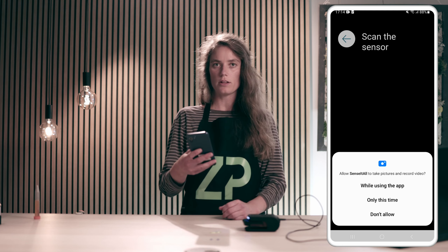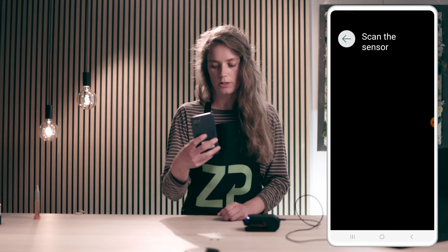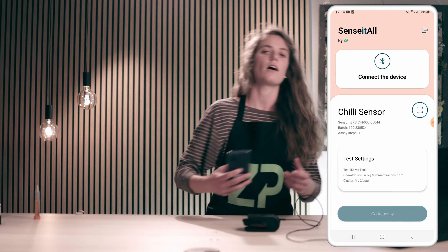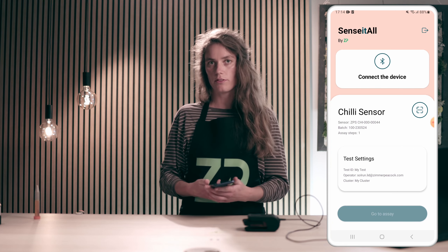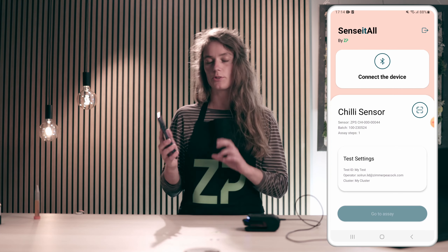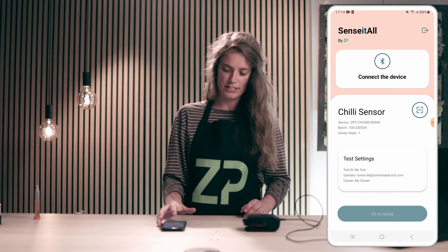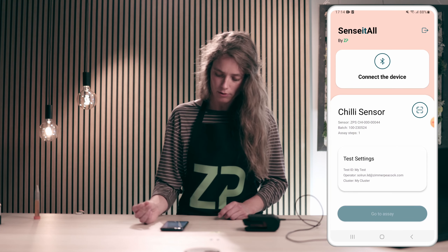You need to allow the SenseIt All app to take pictures while using the app, just so that you can scan the QR codes — because you do get these QR codes with the sensors that you want to test. The SenseIt All app will then connect the sensors to the assay in particular. Now you can see on the SenseIt All app that it has detected the CHILI sensor assay and uploaded the batch number and so forth.